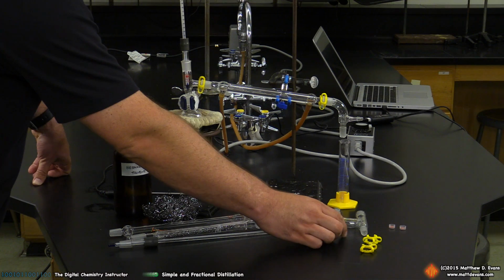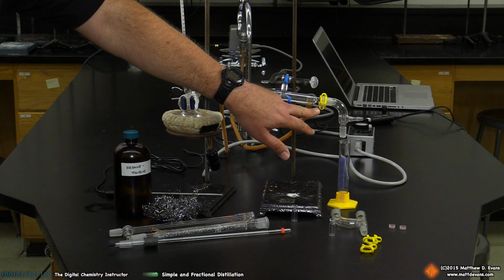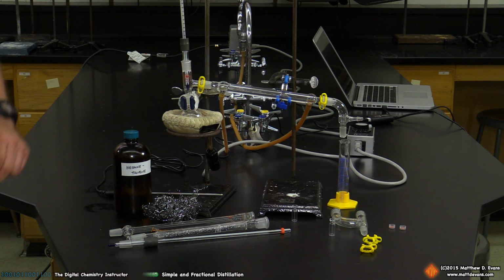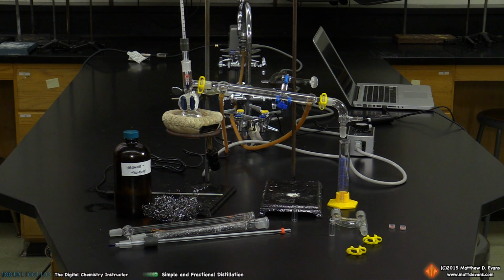A couple other things to mention about this setup. One thing I almost forgot to mention is the water, the incoming water supply must enter on the low side of this condenser and exit out the high side. That's the way it's always done. So that's another little bullet point. Don't forget to put Keck clamps here and here, but don't put a Keck clamp here. This is held in by gravity.